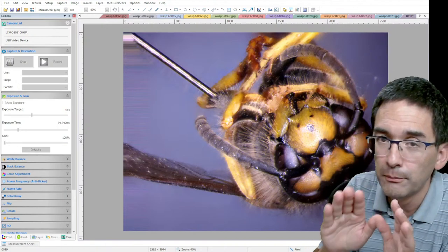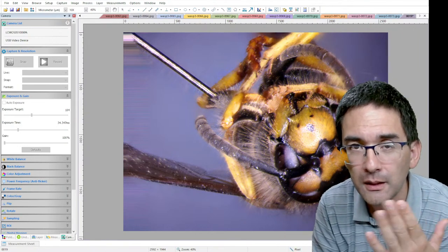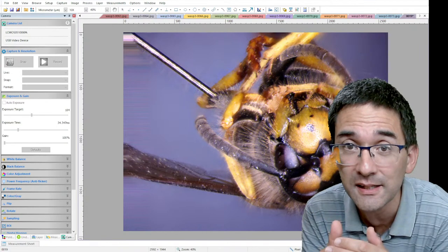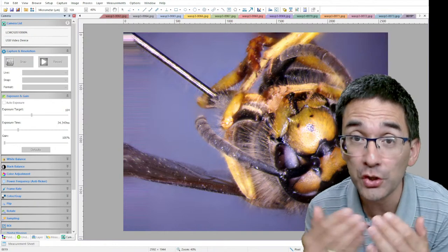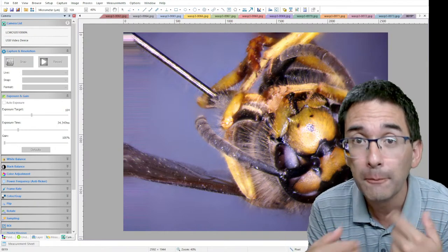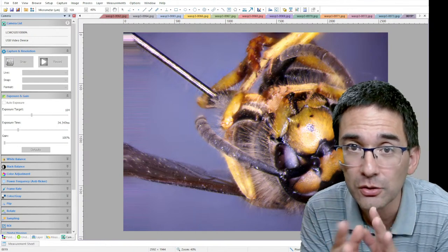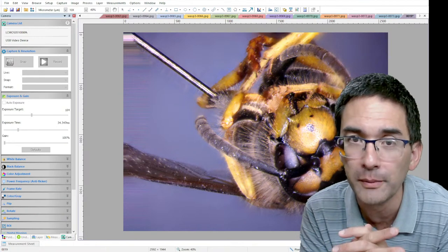But what we need here for this type of stitching is planar or horizontal movement. Now, I used to also make instructional videos, and I used to recommend the program MS ICE, Microsoft Image Composite Editor, which does very good stitching and also allows for planar stitching. Unfortunately, it's not maintained anymore, so you have to search online, or you can still download it from somewhere. But if you want to try MS ICE, it's also a recommended software.